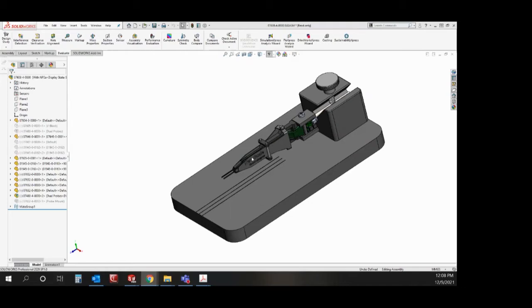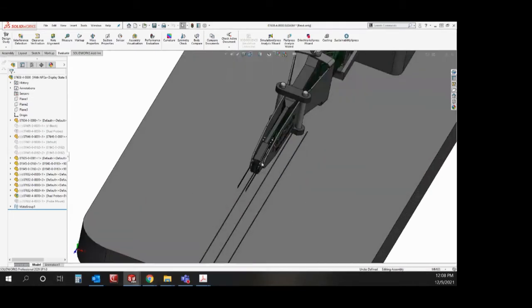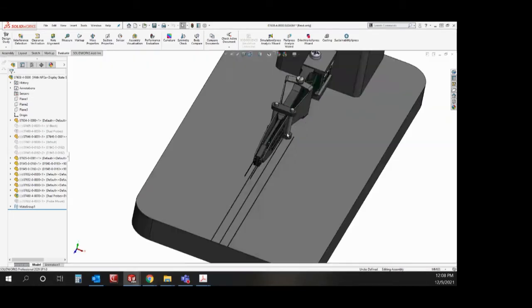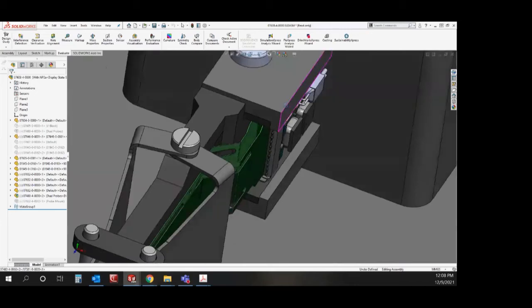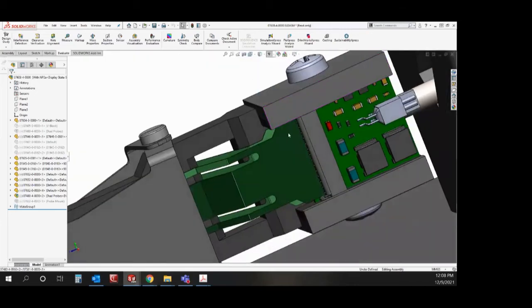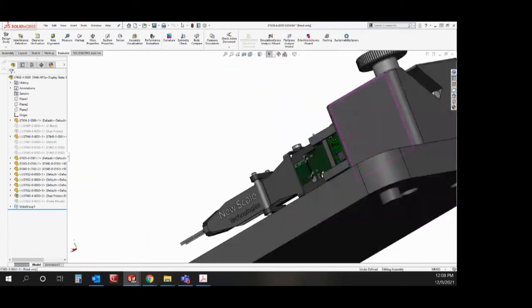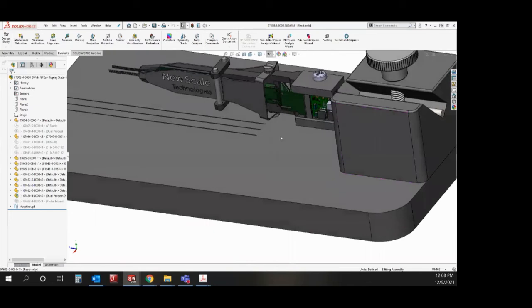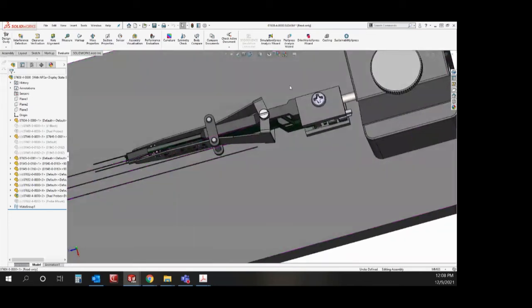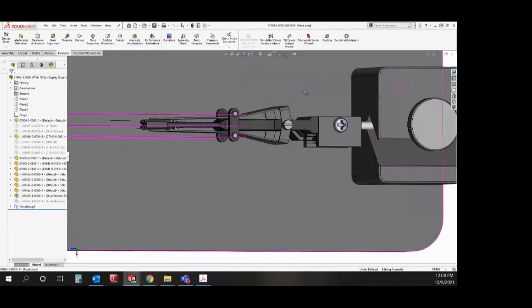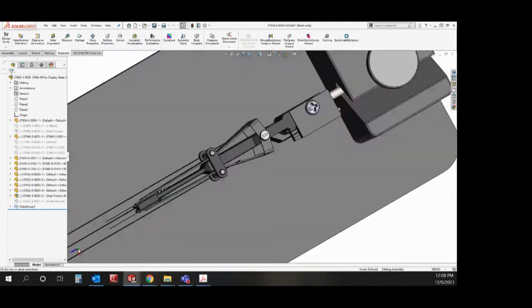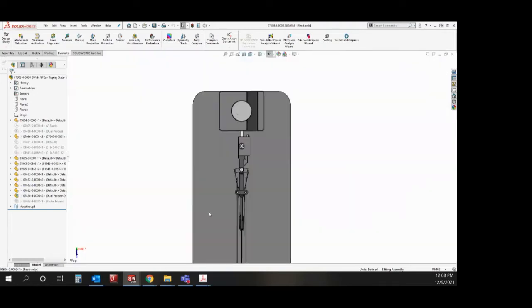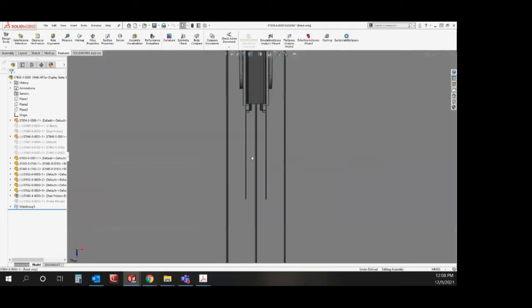Our new probe mount is able to hold two probes simultaneously as well as holding the head stage, and our alignment fixture will hold it to aid in installation as well as checking for the alignment of the probes with respect to the insertion axis.